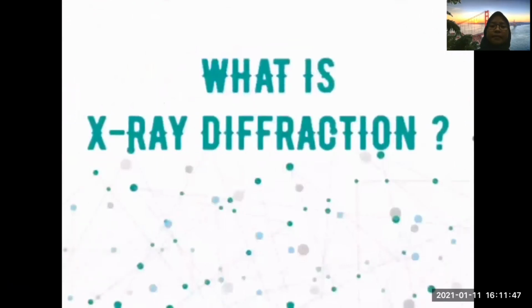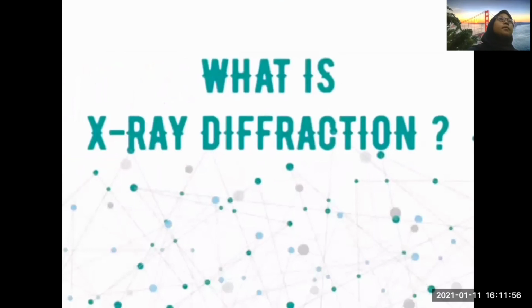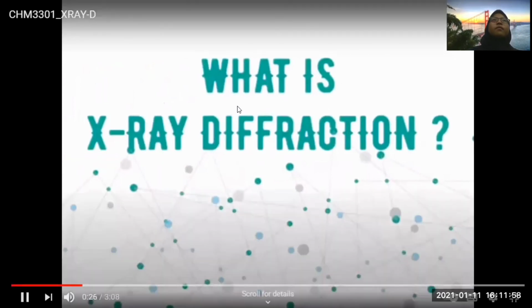We use X-ray diffraction to do this. XRD can identify thin film materials, analyze crystal structures, detect defects, and more. In other words, it gives us material characterization. This is an image of the XRD system we have access to.